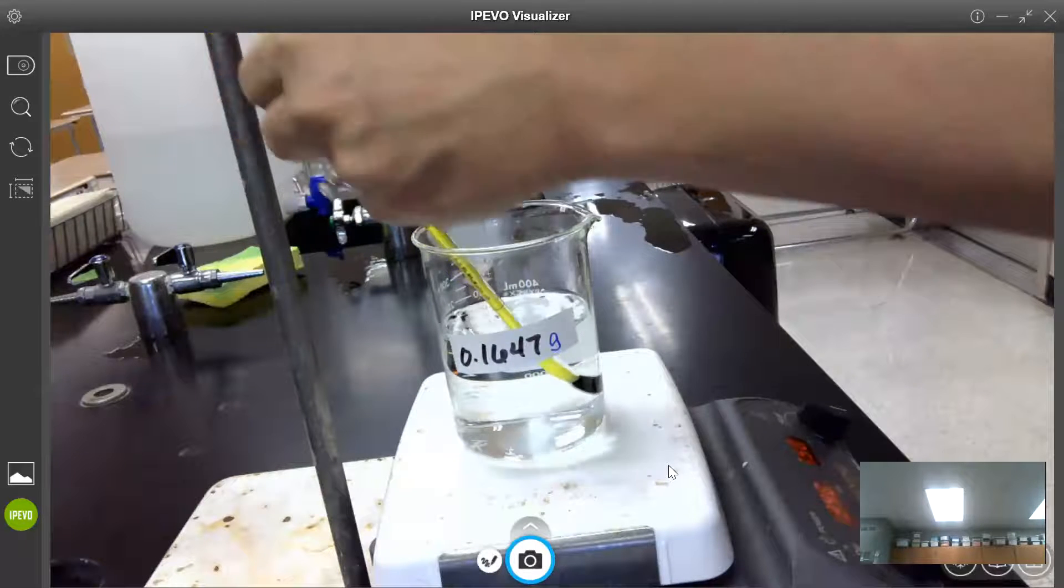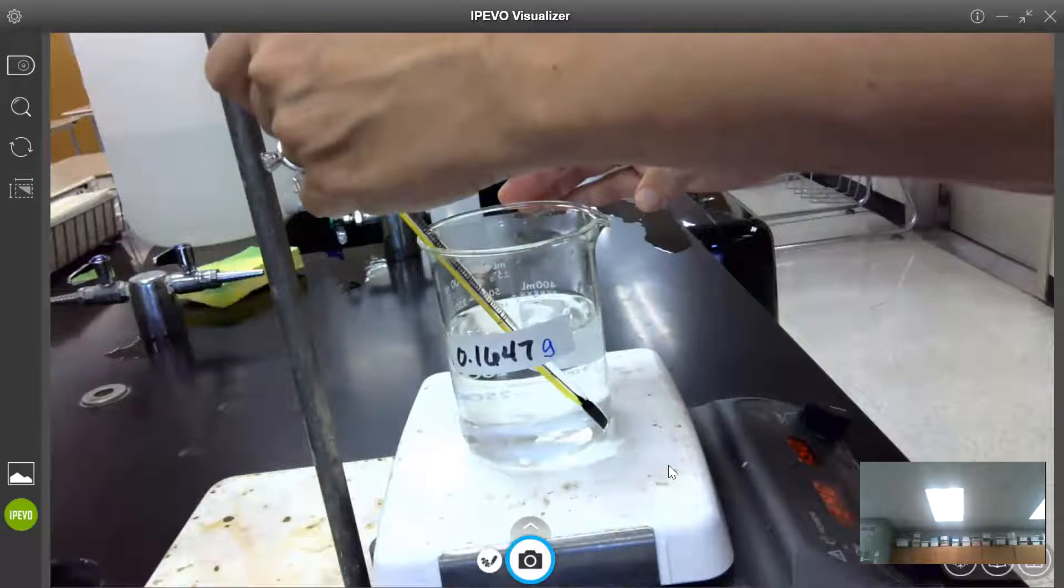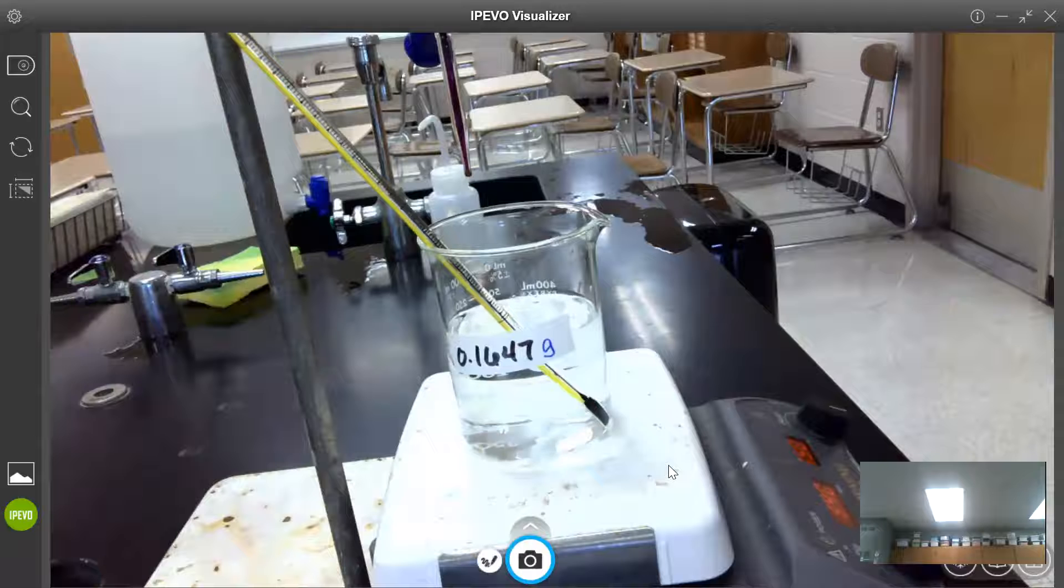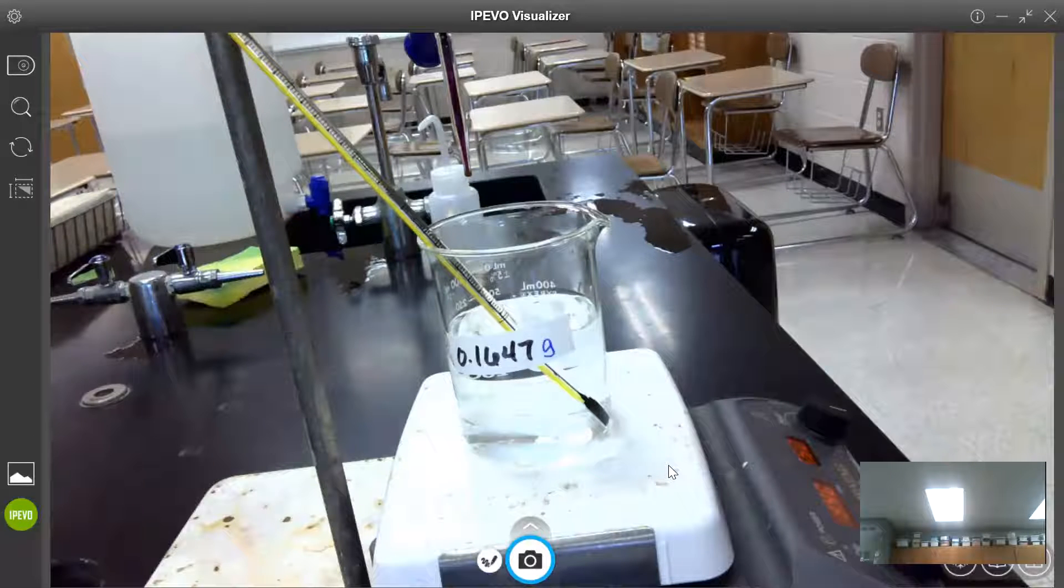And so this titration that occurs is going to be done between 70 and 90 degrees Celsius. So I have to wait for the solution to get up to that temperature which is just going to take a couple minutes.